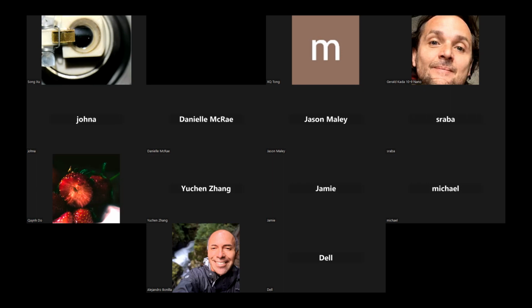I might have a couple of minutes because I just put on my AFM computer, which is also online. I can show some of the basic steps on the instrument itself, and you can actually see it operate. Give me a second. Host. Yes.